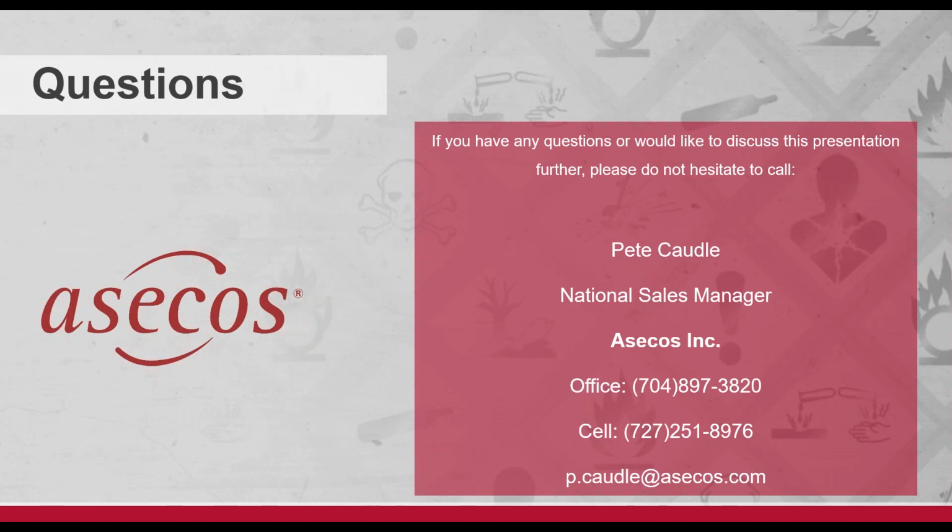So have a quick conversation with the AHJ, the authority having jurisdiction, and they'll help dictate your thoughts on that. My typical process, and where I would start, is trying to duct it into your other exhaust coming out of laboratory space, whether that's a fume hood, whether that's a snorkel, something like that. And they don't need to be on independent lines. That's where I would start your design and communications with the AHJ.